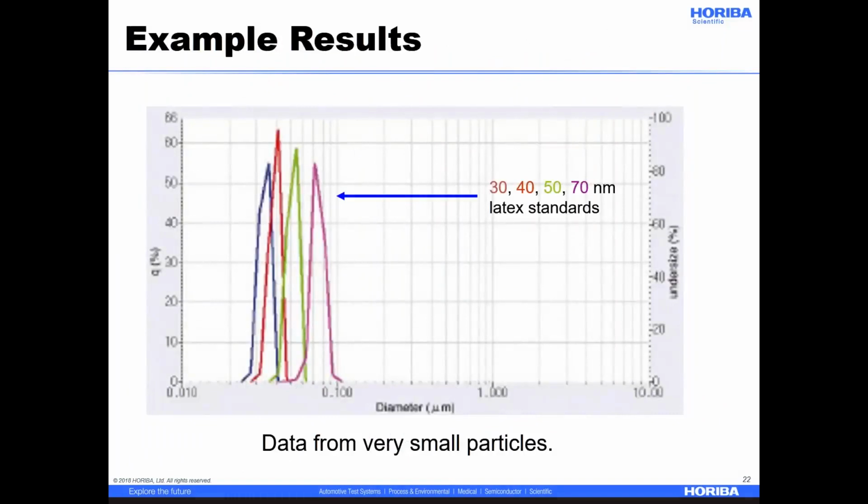Okay, moving to a few results. And I should back up and say that I blew through the math fairly quickly, deliberately, because I really let the machine do it most of the time. And certainly anytime I'm doing a series of measurements, I don't think much beyond rules of thumb for scattering. I don't need to. Our software takes care of that for me, and it's a great relief.